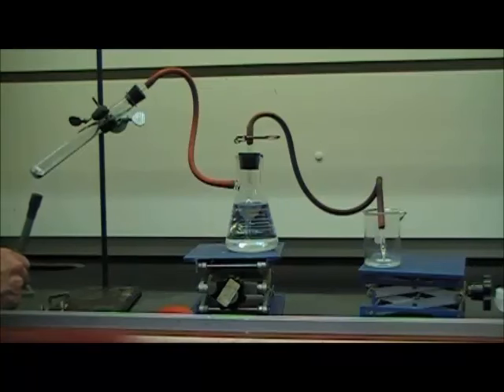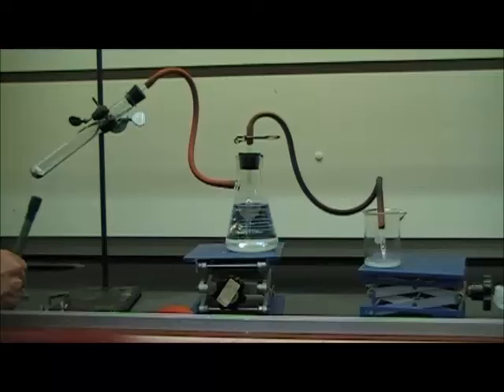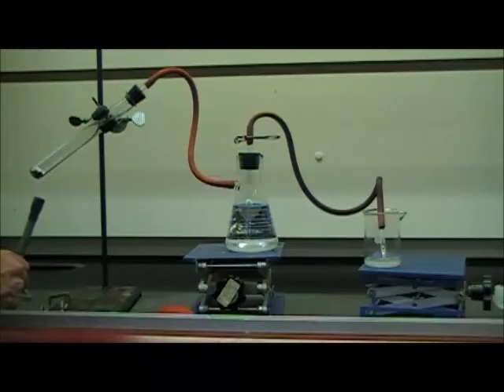And as soon as it does, you'll notice the level of water in that beaker is decreasing. In fact, you may notice the water level in the beaker over there is actually increasing at this point, so it's beginning to happen even though I don't see bubbling yet in the potassium chlorate. See more water going over into the beaker over there? Now it's beginning to bubble in the test tube.